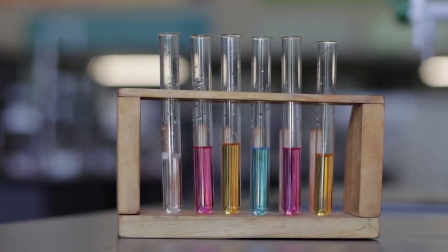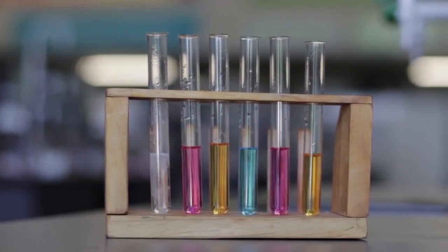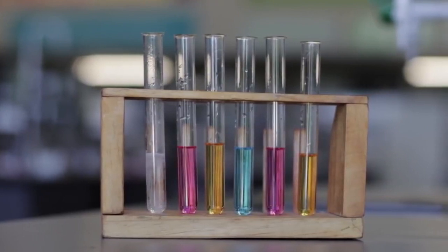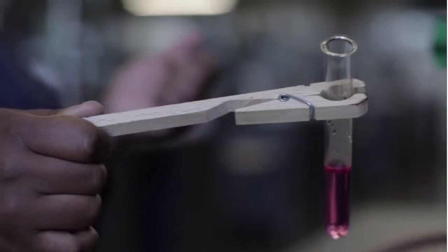A test tube is long, U-shaped glassware that is open at the top and closed at the bottom. Test tubes are used for qualitative experiments. They are used to mix, hold, and heat solutions and then observe the changes.